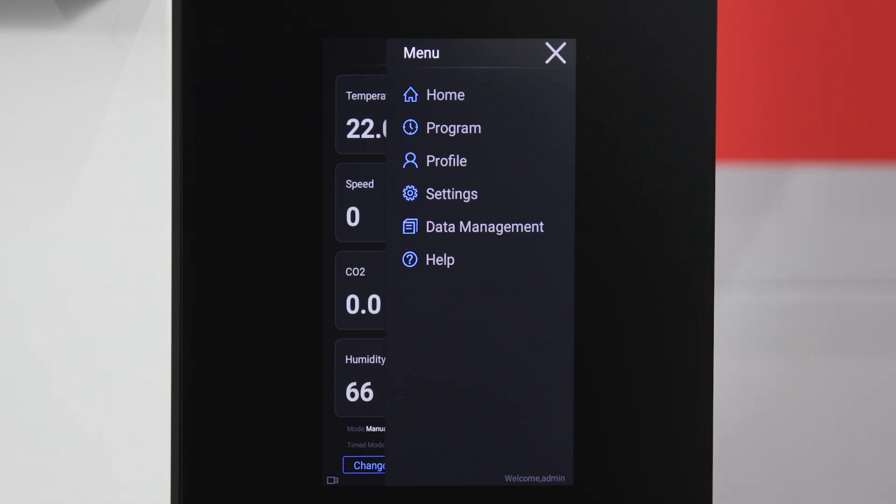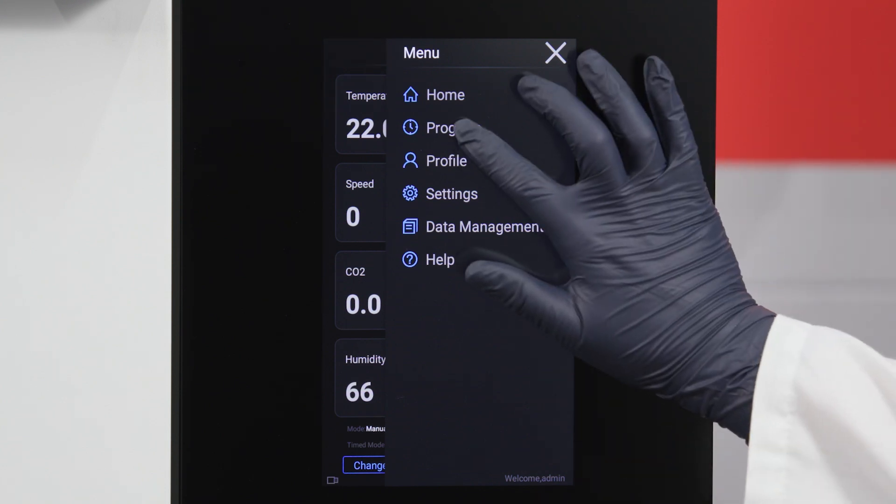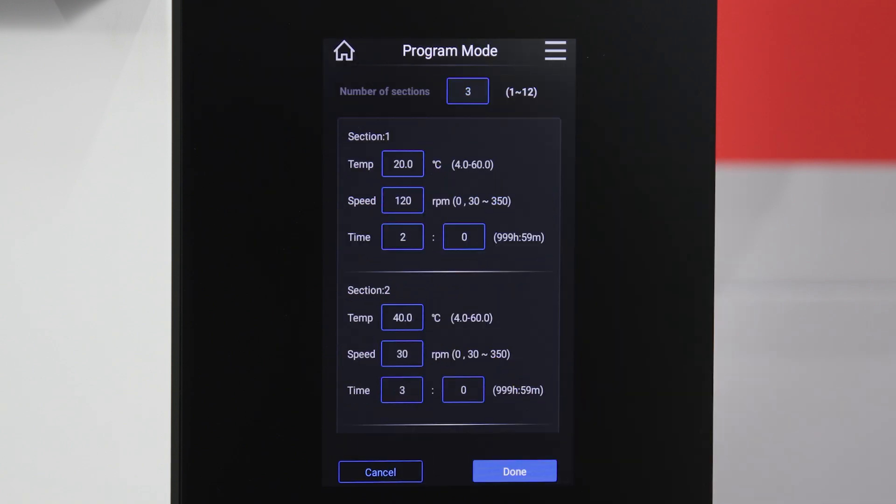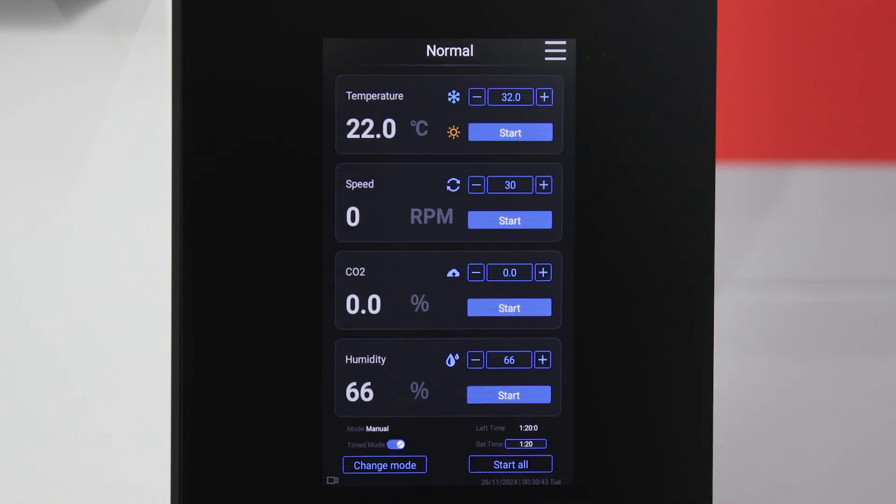As mentioned earlier, you can access program mode from the main interface and adjust parameters by selecting program through the menu navigation.